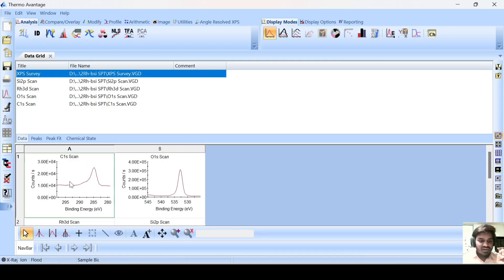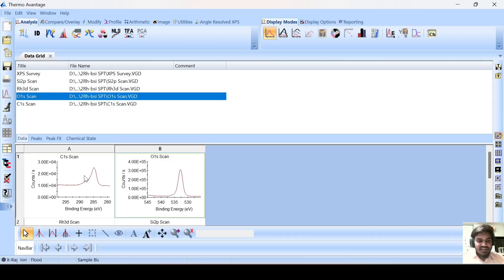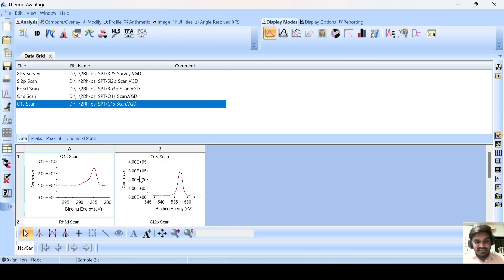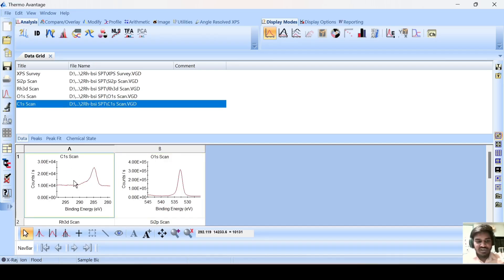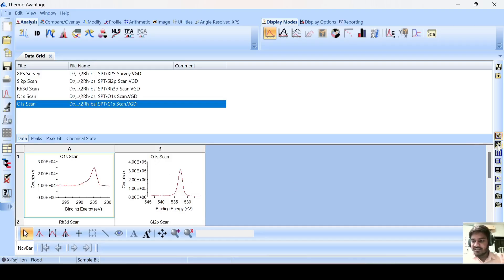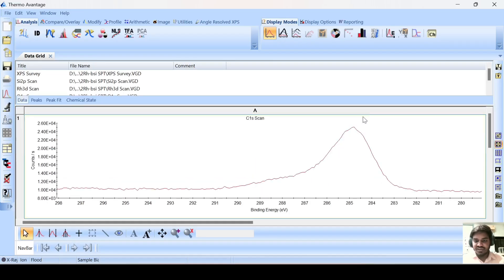Now we will do the peak fitting. First of all, we will do the peak fitting for this carbon C1s. This means it is selected. If you want to select this one, click on this and the 1S spectra will be selected. Now I want to do carbon 1S express fitting. Here are two tools — one to minimize and one to maximize this particular spectrum. I want to maximize this spectrum and make it big.